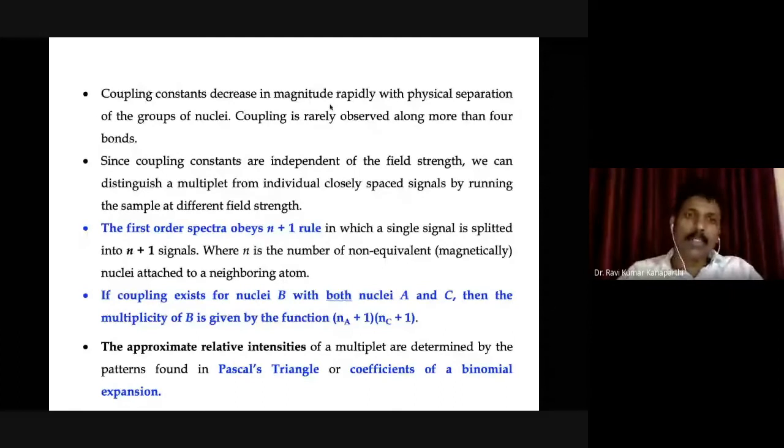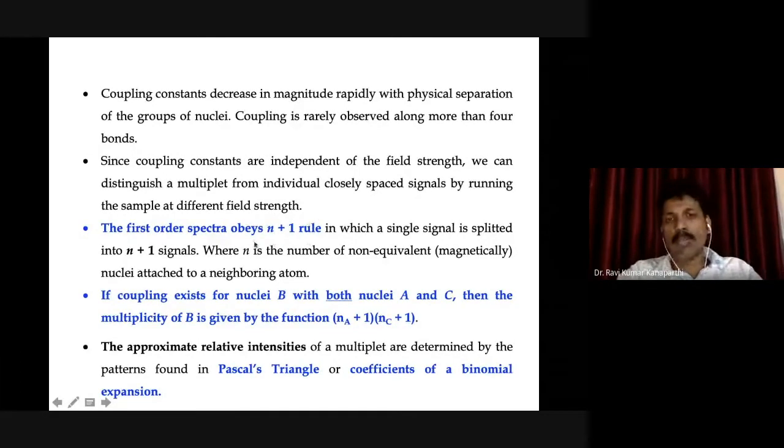That is the rule we have discussed. If you say it is a first order spectrum, it should follow the n+1 rule.